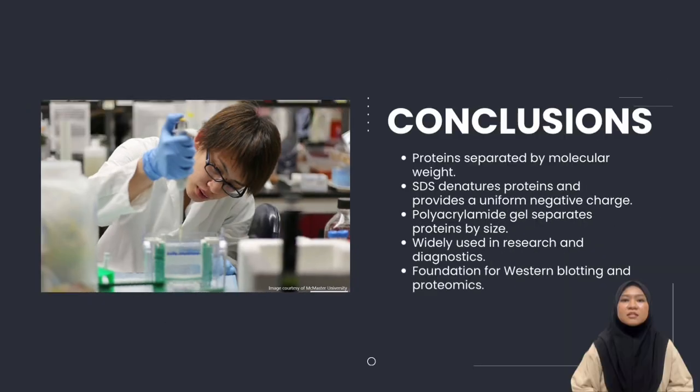In conclusion, SDS-PAGE is a simple yet powerful technique for separating proteins according to their molecular weight. By denaturing proteins with SDS and separating them through a polyacrylamide gel under an electric field, researchers can accurately analyze protein size and purity.